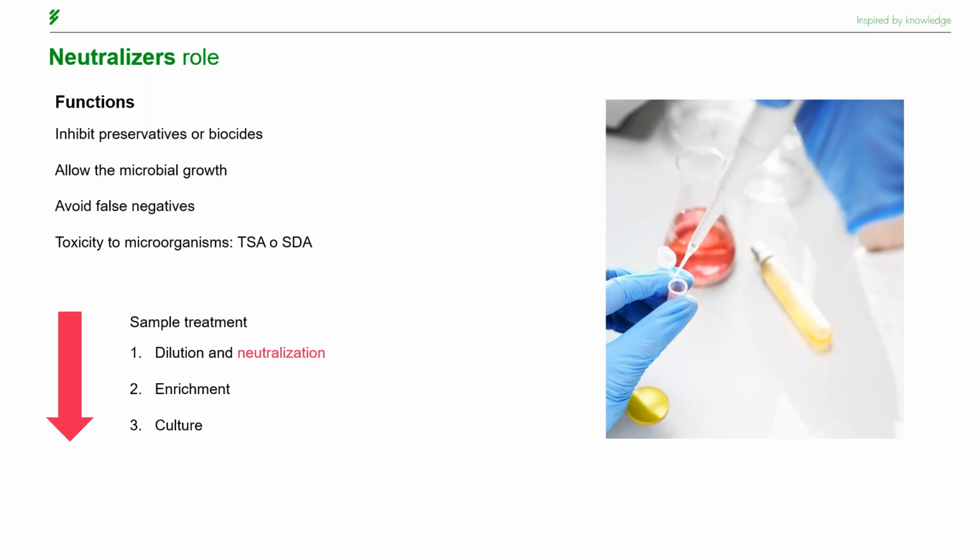Controls to measure toxicity of the neutralizer to the microorganisms should also be included during its evaluation, which can be determined by comparing growth in neutralizing medium versus growth in general media, which would be TSA or SDA.